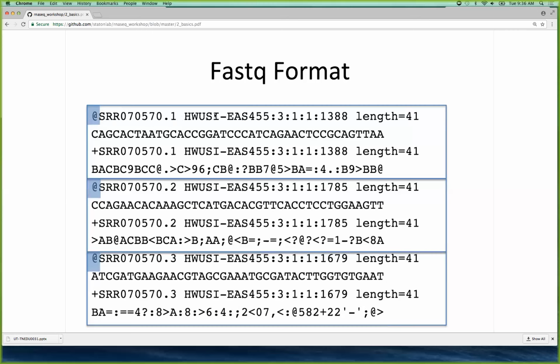This is a very typical Illumina name. All of your Illumina data is going to have this stuff. This is actually a unique machine ID number, so if you download Illumina data from somewhere else, you can track it back. If you know the machine numbers, you can figure out what sequencing facility sequenced it. And this stuff over here is information about where the individual read was located on that little glass slide. You can use that information downstream for some QC. But none of this is really going to matter to you, but that's what it is, so it's not confusing. And then I'll give you a link.